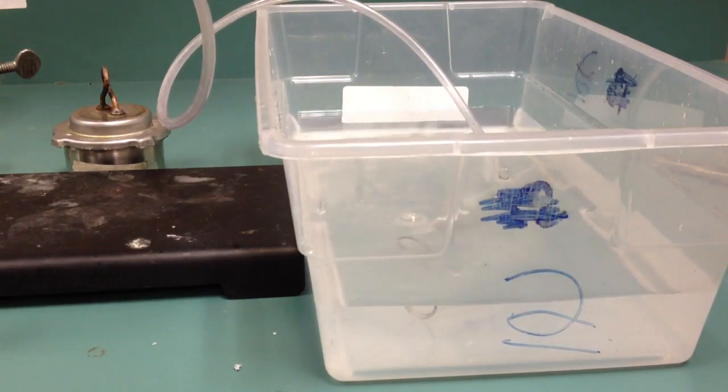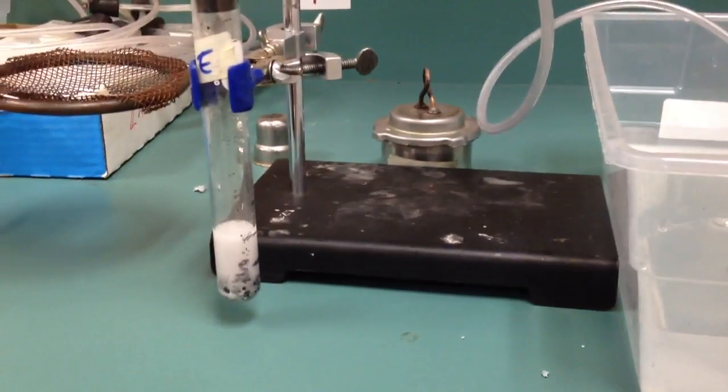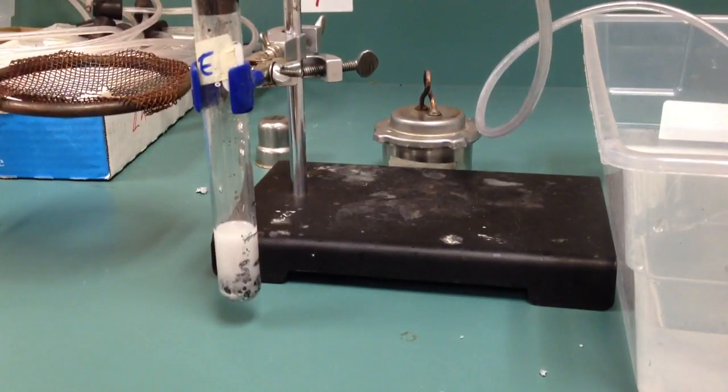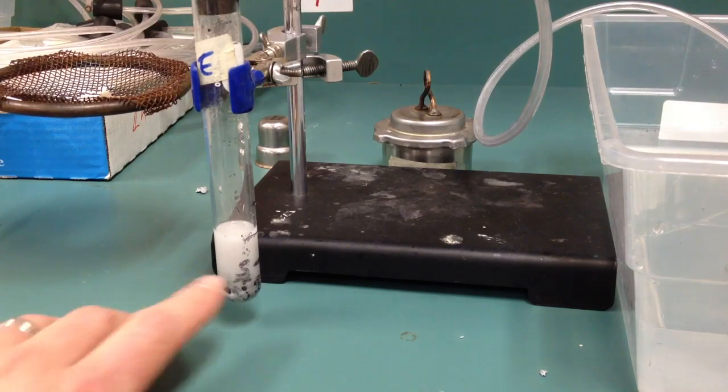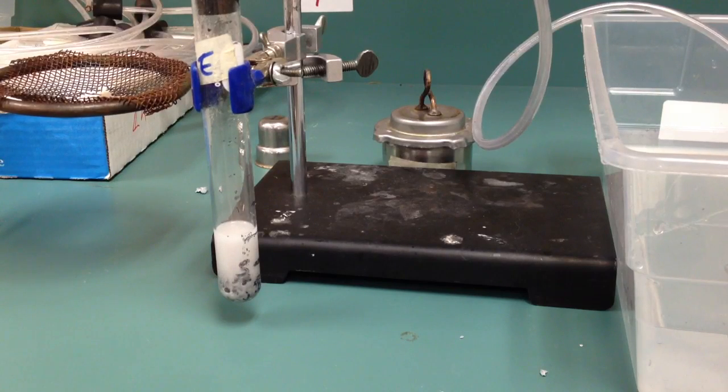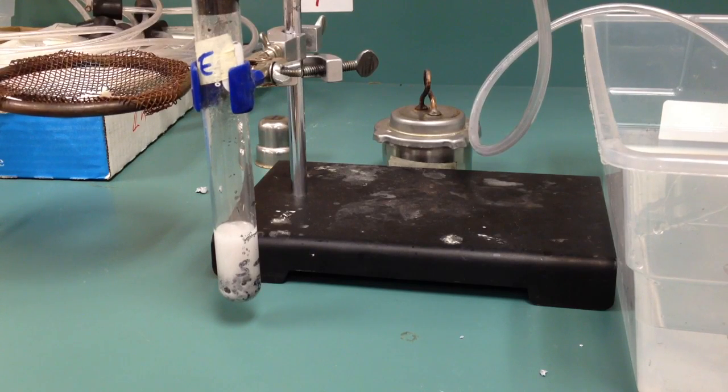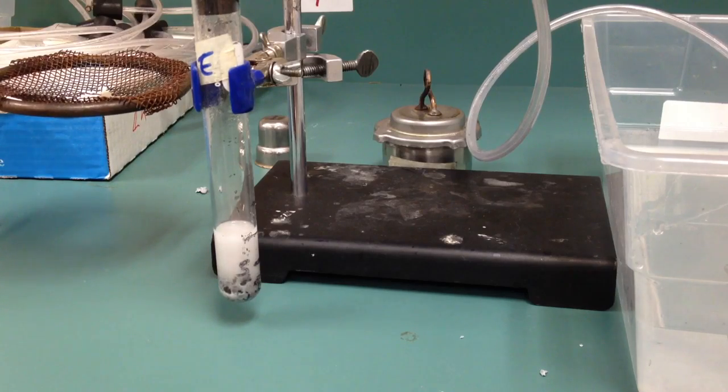Now, if you remember, I told you over here, we're making zinc chloride. The zinc is grabbing the chlorine from the hydrochloric acid making zinc chloride. Well, zinc chloride is a white powder. And unfortunately, you can't really see it in there. It looks cloudy, but that's just because of all the gas bubbles. When the reaction stops, it will clear up pretty clear. So, what we're going to do is we're going to boil off some of that liquid and show you the zinc chloride.